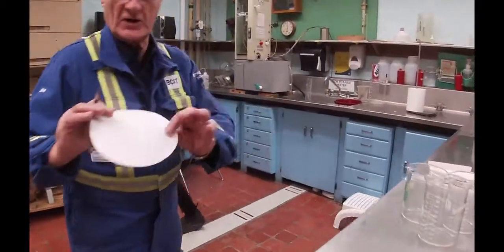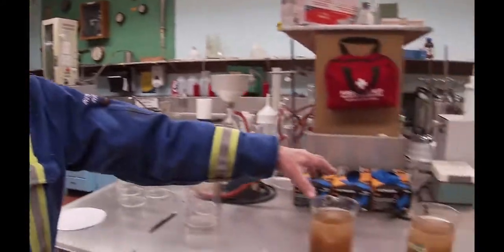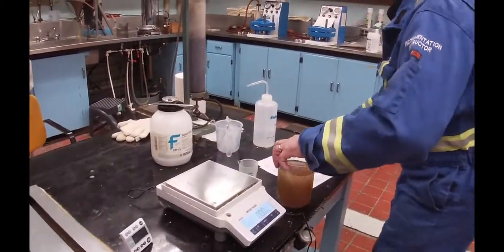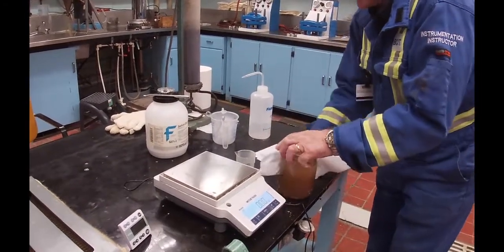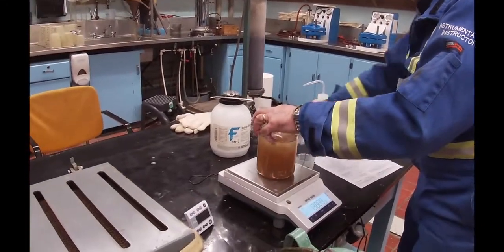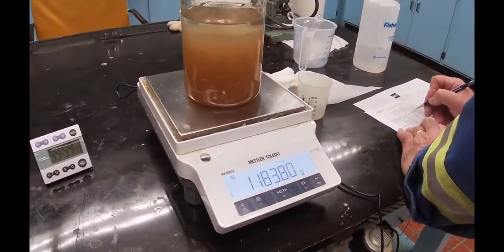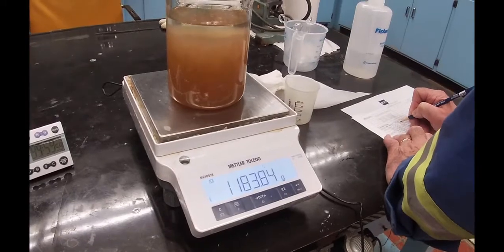You make darn sure when you do this that you put this with the writing on the down side in there. We're going to take one of these samples. The slurry plus the beaker on this first sample came in at 1,183.8 grams.